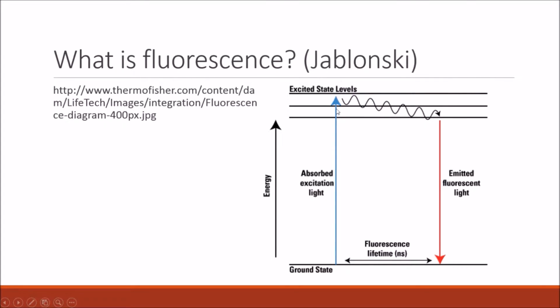When they're at this excited energy state here, the electrons will be vibrating and giving off small amounts of energy. This could be as heat or micro amounts of radiation. All of a sudden, these can then jump back down to ground state, releasing energy equal from this energy state down to this, and this is often given off as light or other forms of radiation.